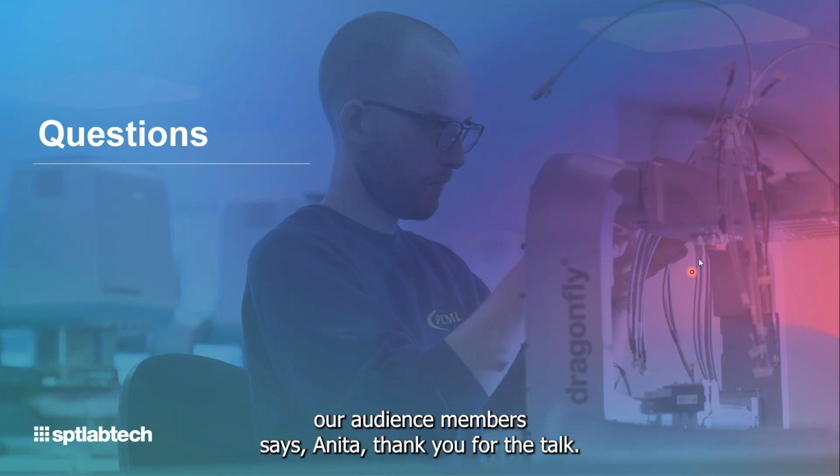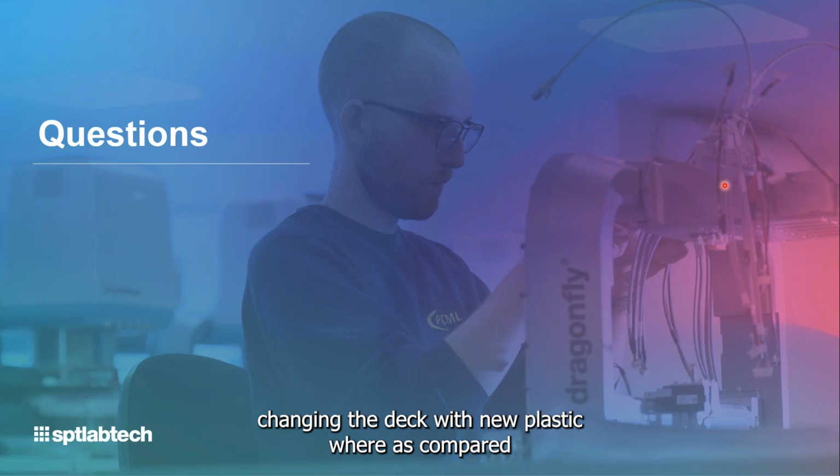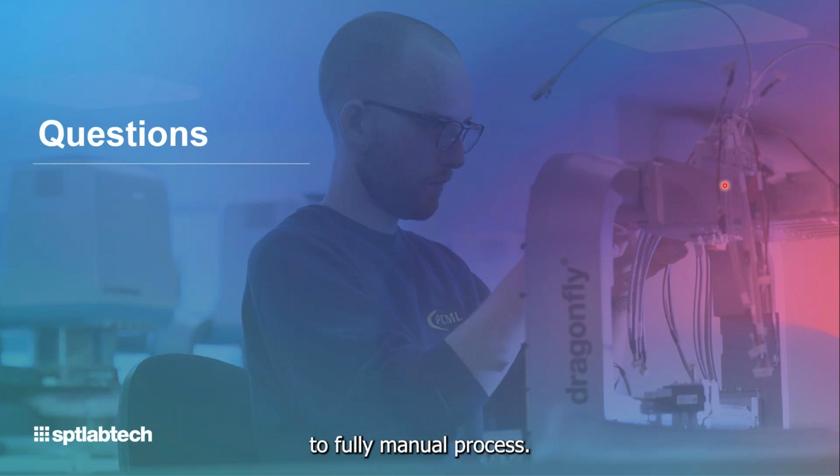One of our audience members says, Anita, thank you for the talk. What was the total time of Ultra FS prep on the Firefly, including changing the deck with new plasticware, as compared to a fully manual process?